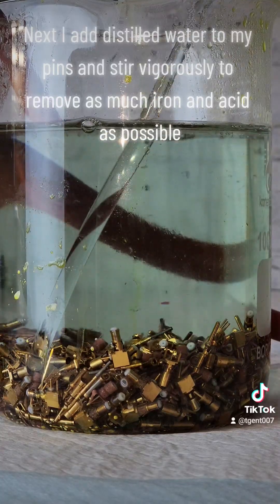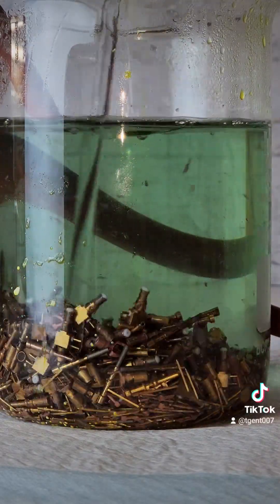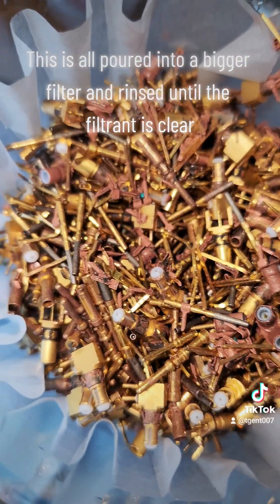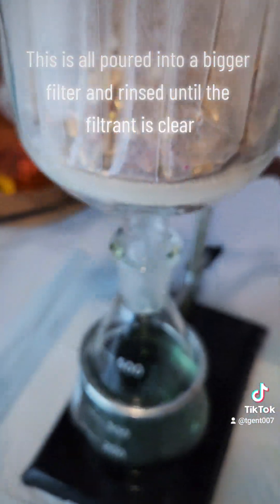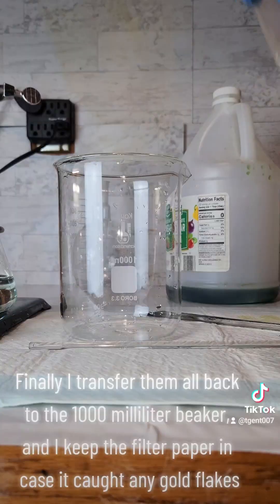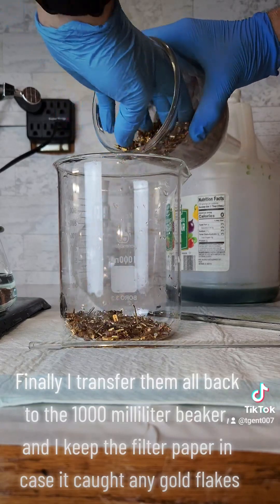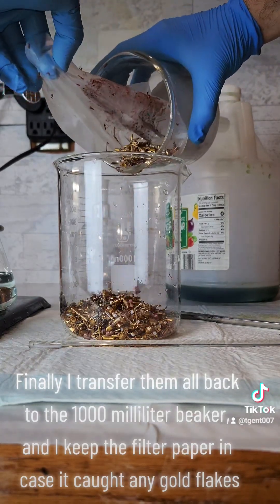I add distilled water to my pins and stir vigorously to remove as much iron and acid as possible. This is all poured into a bigger filter and rinsed until the filtrant is clear. Finally, I transfer them all back to the 1000 milliliter beaker, and I keep the filter paper in case it caught any gold flakes.